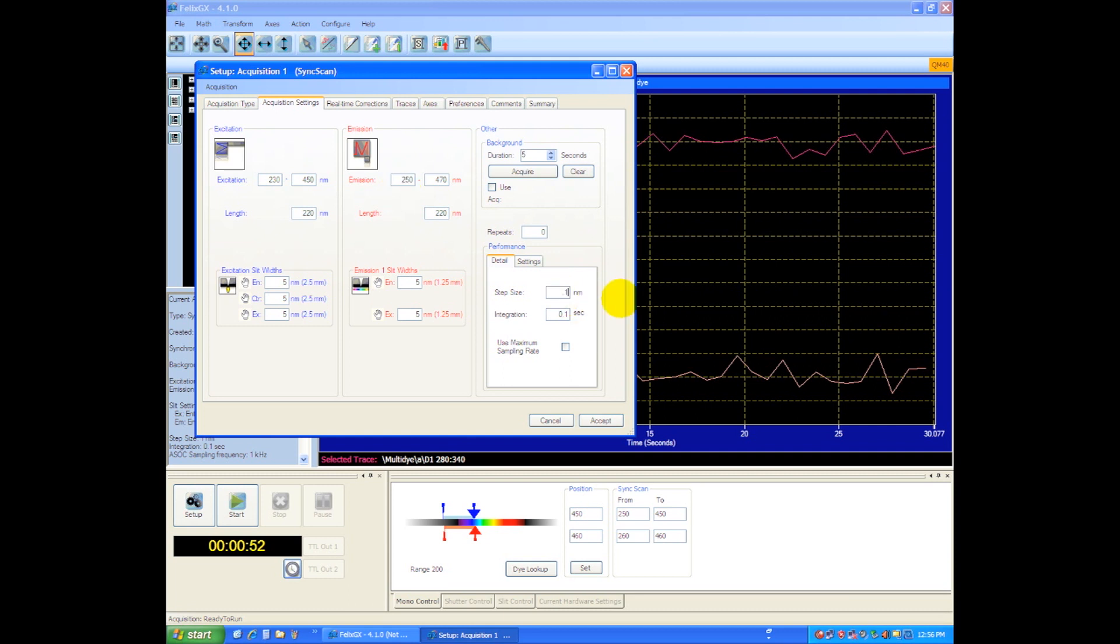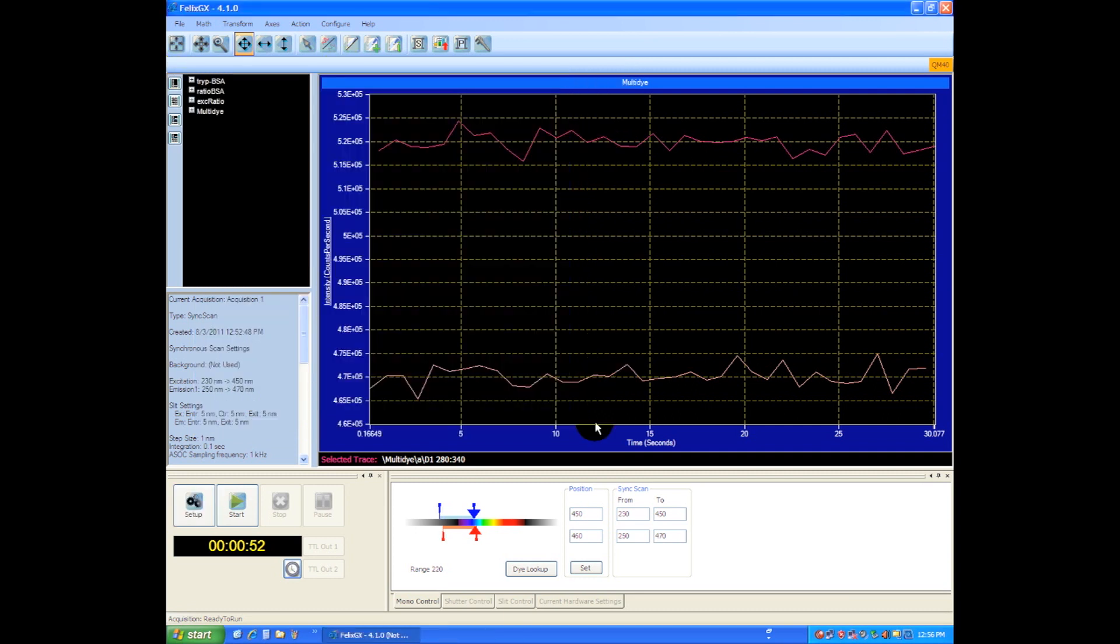So let's go with 0.1 integration, we'll go with a 1 nanometer step size and a 0.1 integration time, and we'll simply say accept to push those parameters down to the acquisition engine. We're going to show a single window and we'll hit start next.